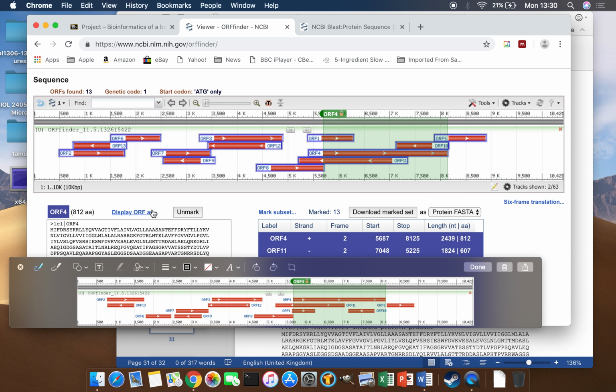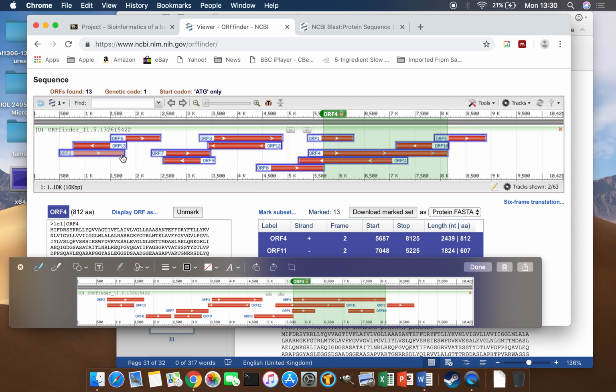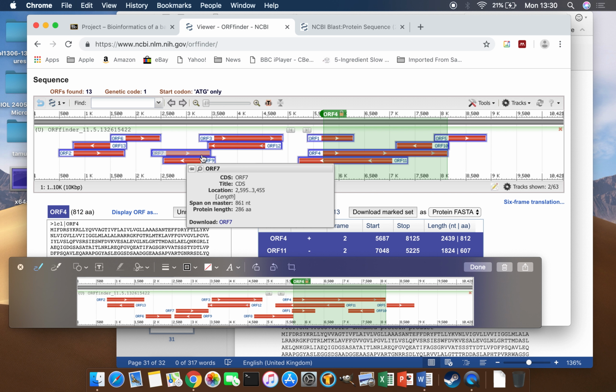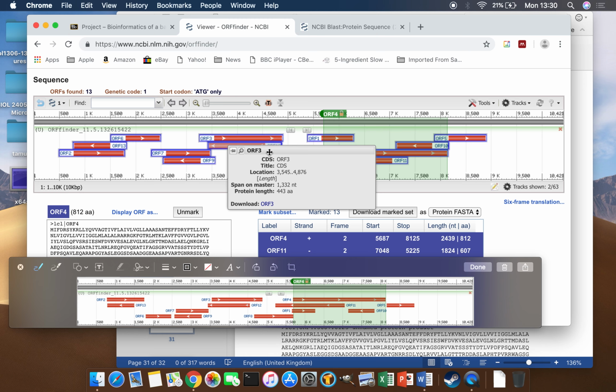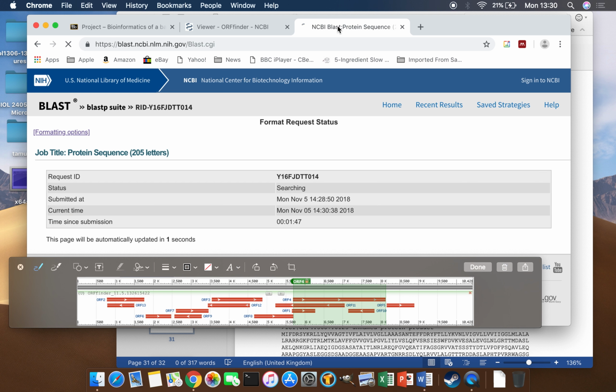The only thing I would say is that in a typical bacterium, there is very little and usually almost no wasted space. So you would expect right where one open reading frame ends, see that open reading frame 2, you would have another beginning almost immediately. So 6 picks up just barely after 2 starts. And then look, 7 picks up right after 6, which is why, since they're being really efficient, I think that's probably the case. And then look, 3 picks up just after that, etc. On and on. Okay, let's check on our blast, and it's going okay.